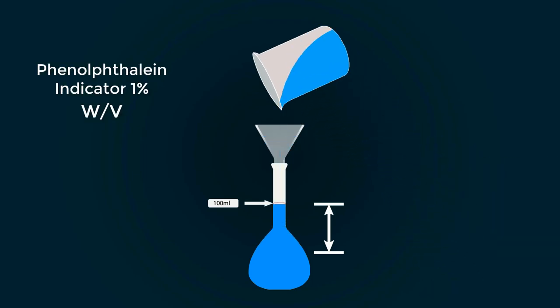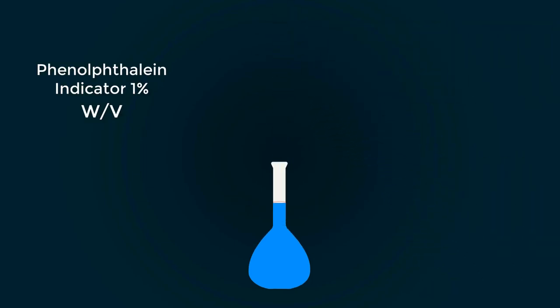In this video you will learn how to prepare 1% weight by volume solution of phenophthalein indicator.